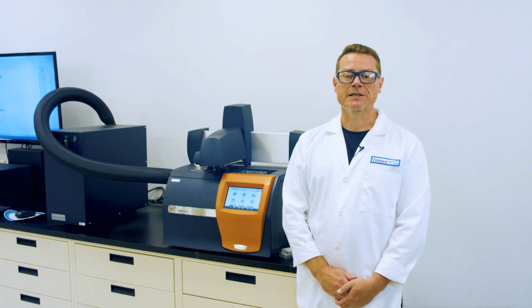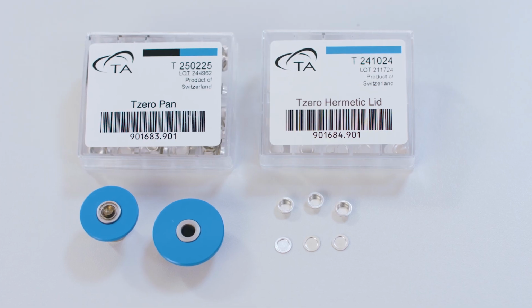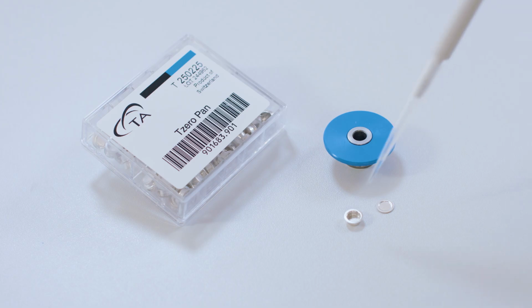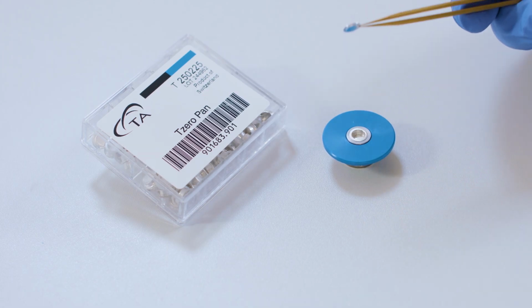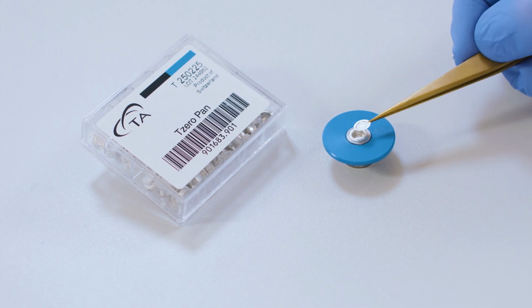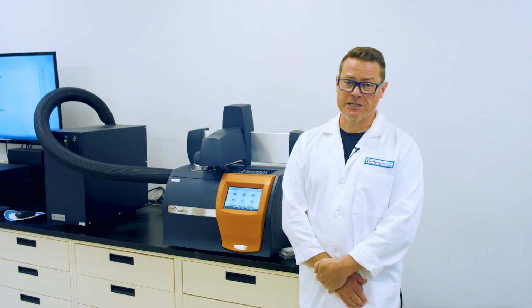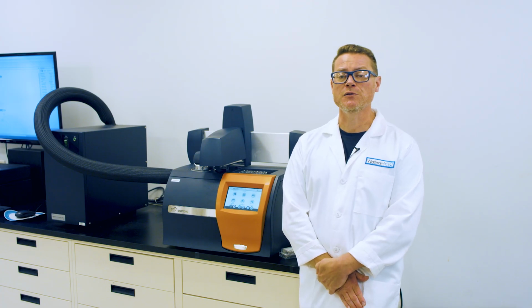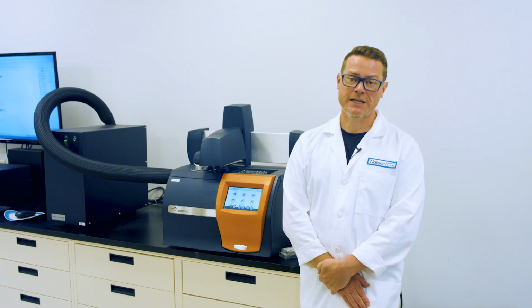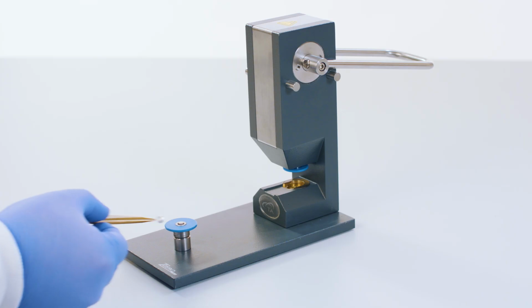Sample masses are quite small, typically 5 to 15 milligrams, and pans may have a lid or be left open. Whether you use a lid or not is actually quite important. Ideally, you should always use a lid, as this allows heat conduction from the sample to the DSC in all directions. Whether the lid is airtight or not is also important, especially for looking at materials that may lose water or solvent on heating. But we're going to look at those in more detail in a later video.